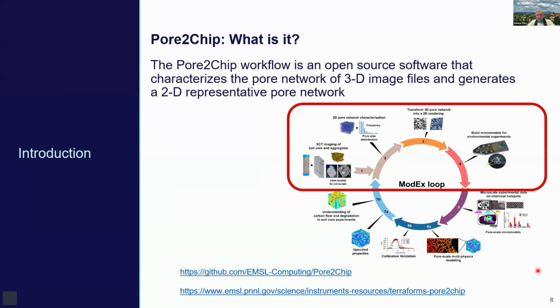Rami: So, may I ask, is this transparent? Can you put this under a fluorescent microscope? Oh yeah, absolutely. We'll talk more about the chips later when we talk about manufacturing. But yes, these are very transparent, and you can do a lot of your chemical imaging or whatever optical imaging on the chip afterwards.